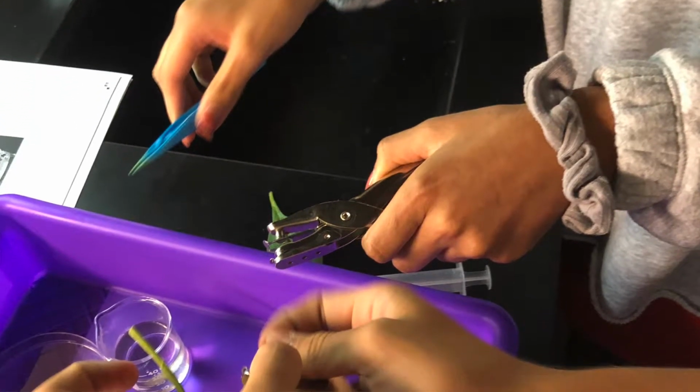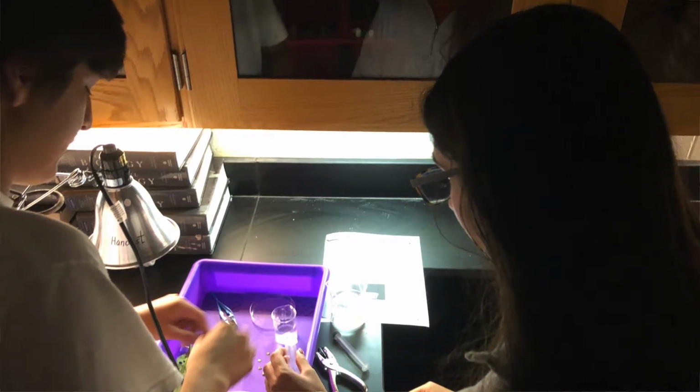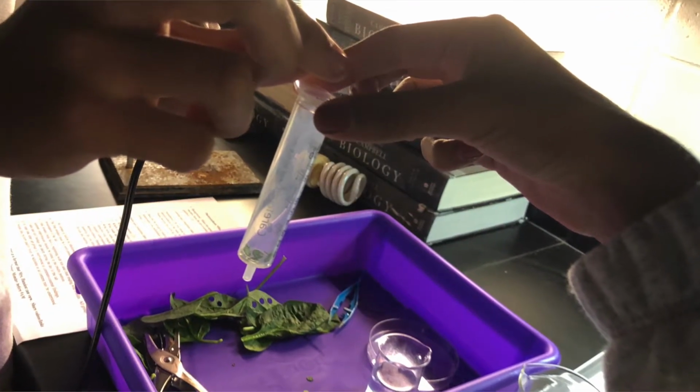To start, we punched 10 equal-sized holes out of the spinach leaves using a hole punch. Then we took the syringe, took the bottom out of it, and put the 10 equally cut circular leaf pieces inside of the syringe. Then we put the other part of the syringe back in and sucked in some of the 0.2% bicarbonate solution so that it was full of the solution plus the spinach leaves, and then we squirted out any air that was inside of it so we could continue with the experiment.